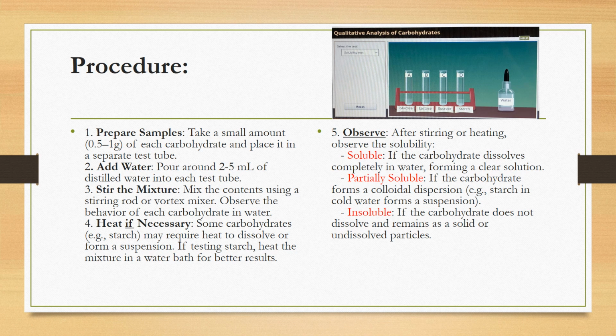Step number 2, add water. Pour around 2 to 5 ml of distilled water into each test tube. Number 3, stir the mixture.